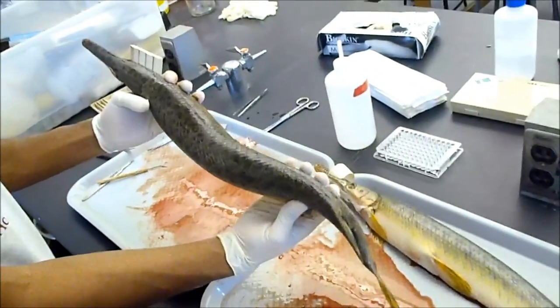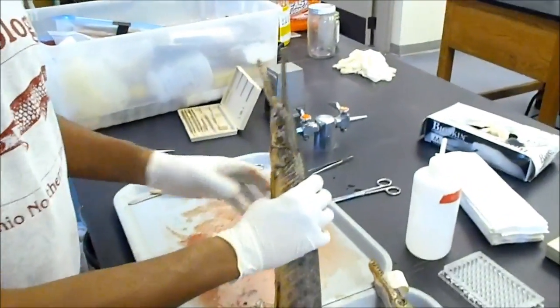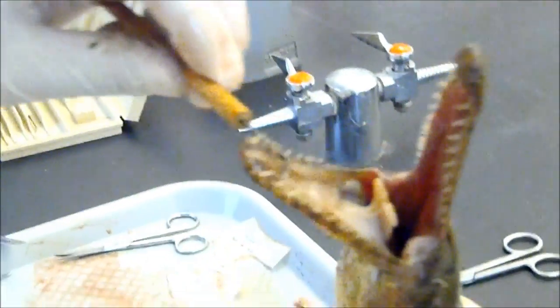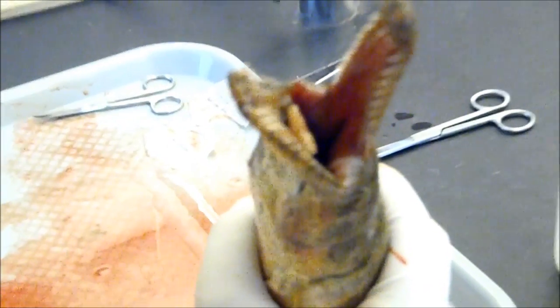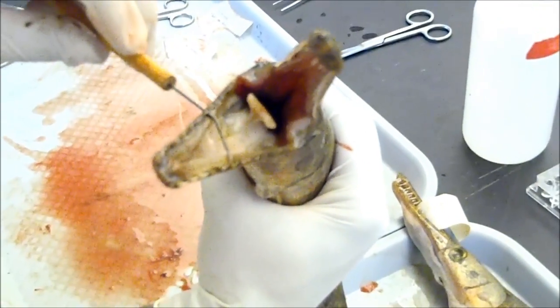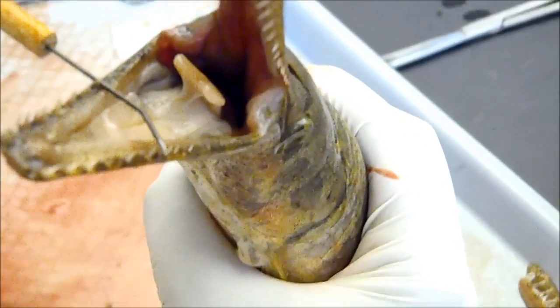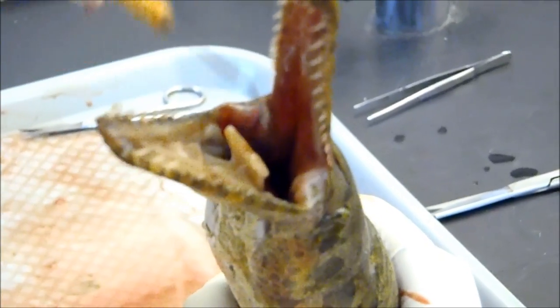The muscles for the jaws have been loosened up so you can get a good idea of the teeth. Wild fish tend to have larger teeth than fish raised in captivity. You can also see the forked tongue — this fork helps in guiding prey, making sure they go in head first as the fish swallows them whole.